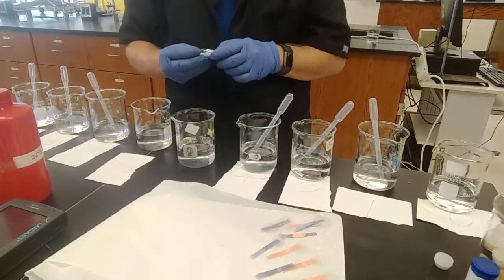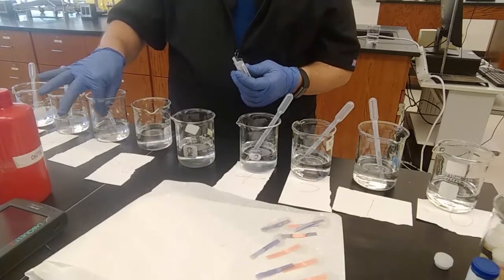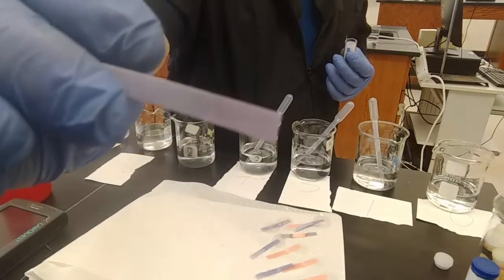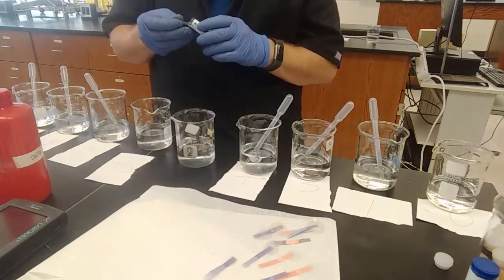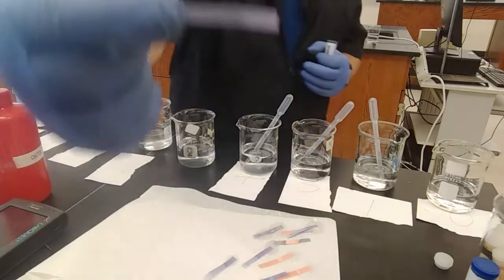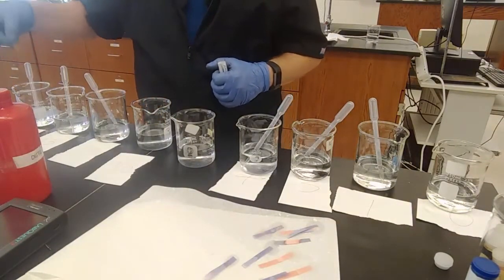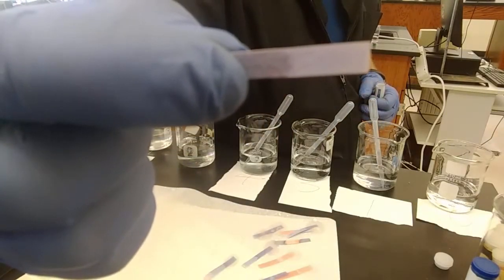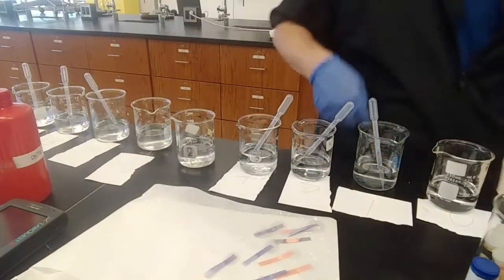Let's see. We'll go on and do 11, 13, 14. 11. Proper procedure again is to dip a stirring rod in there and touch it to the paper. Just not doing that for time. No change. As expected, but doesn't necessarily agree with our meter. 13, no change, definitely as expected. Switch it around to the other end. Final test for 14, and also no change, not even a hint of pink on there. So, litmus paper, limited utility.